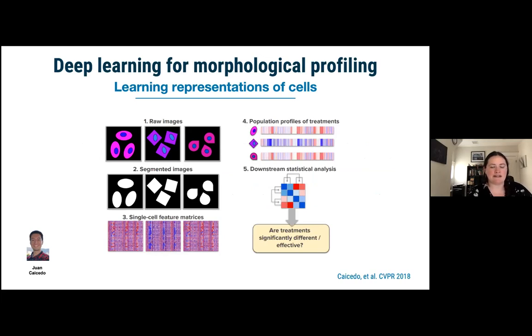And what he said is essentially, deep learning feature measurements, and I'll talk a little bit more about exactly what that means, are just as valid to describe a biological image as things like a Zernike feature or a texture or even an intensity. And a lot of those, human brains are really bad at understanding what they mean anyway. So if we don't care about necessarily understanding what the individual biological features in our images are, we just know that we need a lot of them, can we use deep learning, because those are numerical measurements of images and objects that are just as valid as something like a texture or a Zernike feature.